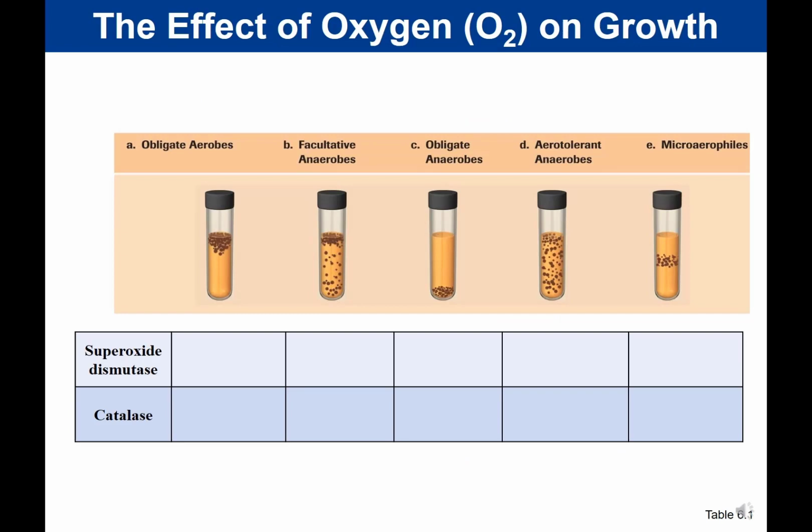So now let's talk about why organisms fall into one of these categories.